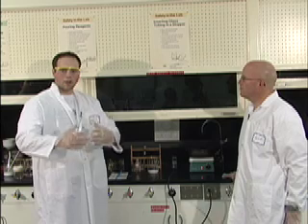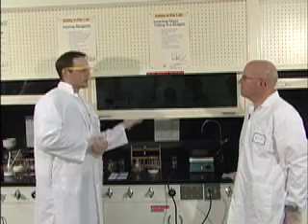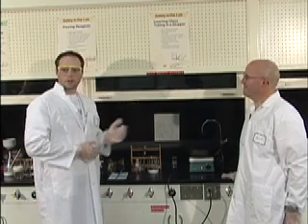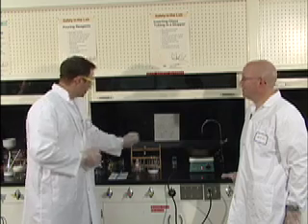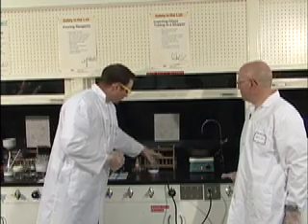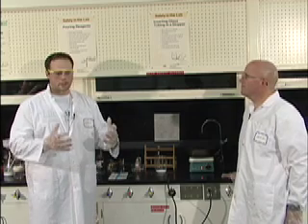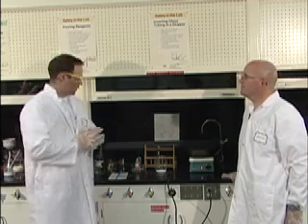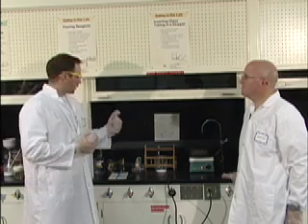For video purposes, Jeff and I will take the risk of not having it all the way down, okay? However, you'll notice how deep we're keeping this in the fume hood. It is important when you're using acetic anhydride that you have your instructor present while you're doing this. I know this seems maybe a little silly, but you're going to work in partners.